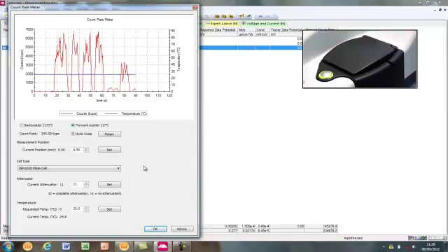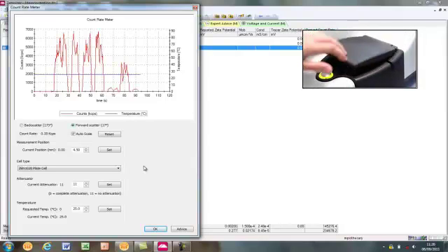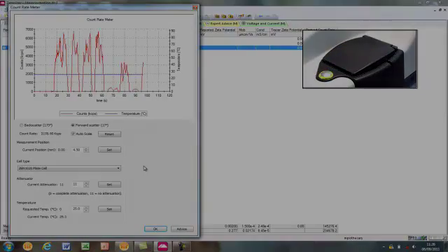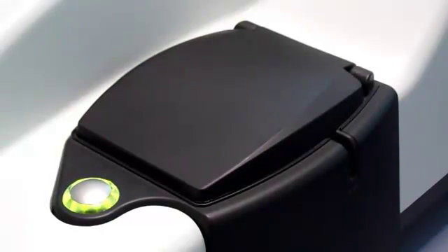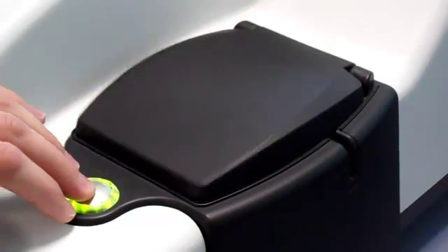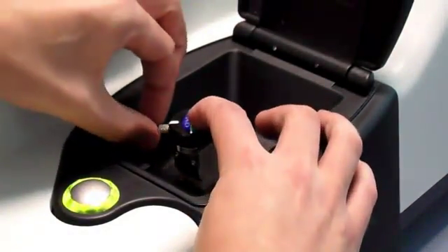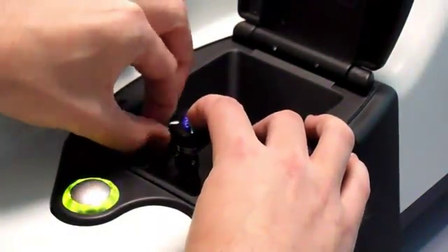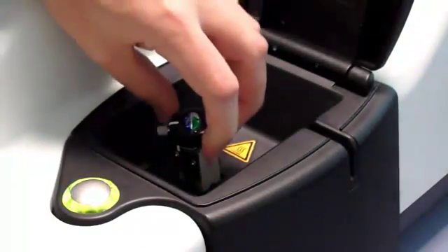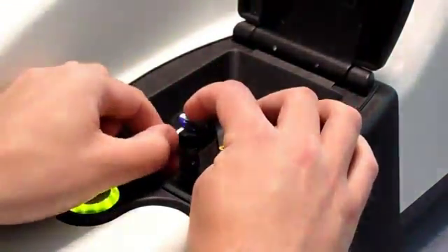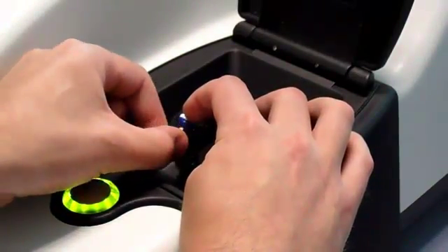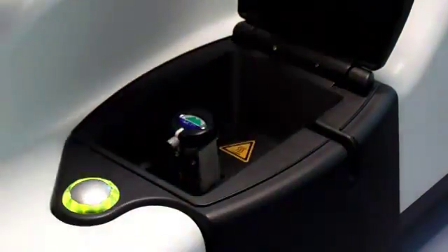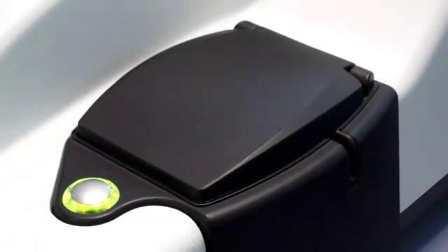Turn the cell cap back 45 degrees to the first position where the scattered light is visible to the system. Once the zero position has been found, the cell cap itself can be loosened by unscrewing the bolt at the front of the cell cap. The cap can be then centred to the front of the cell without affecting the sample height and the cell cap can be re-tightened. This stage is not necessary, but performing it allows the user to more easily monitor the position of the cell and accurately adjust the height of the sample.